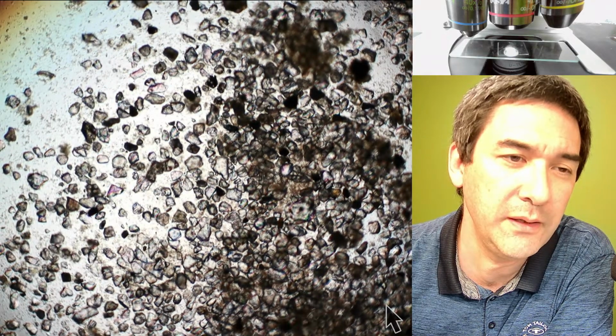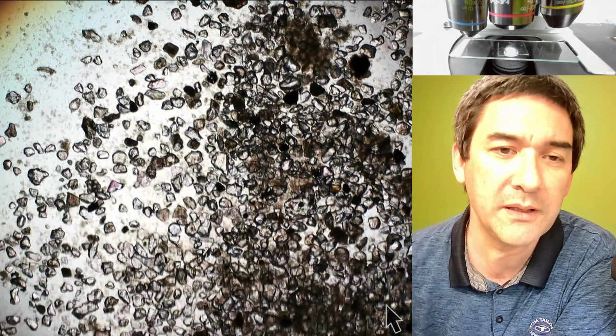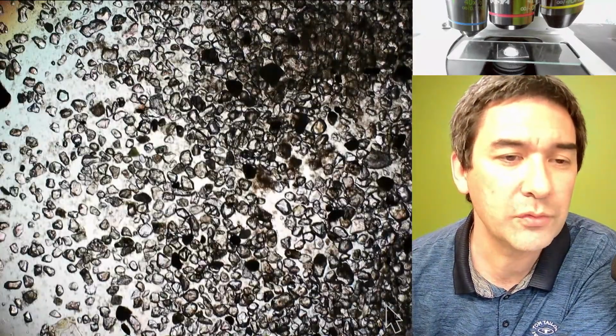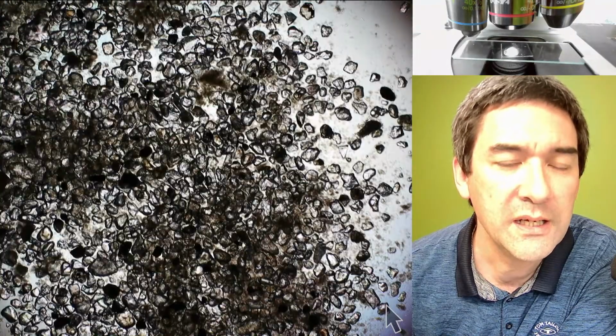We got that. So let's put it in. And yeah, please lower your expectations, everyone. If you're hoping to see a lot of living things in movement, you're probably gonna be disappointed. We see sand grains, obviously, and I'm going to zoom in and maybe we are able to see a few diatom shells.